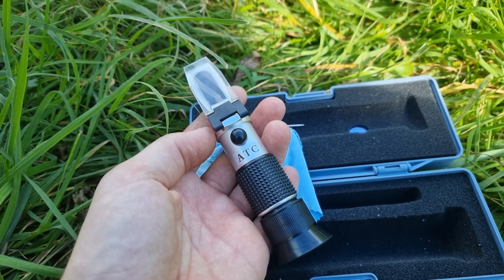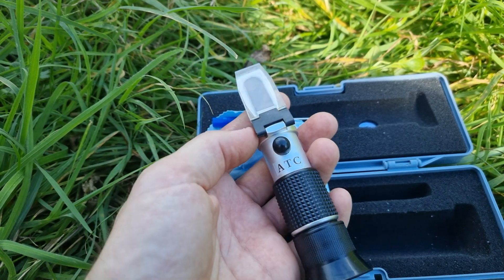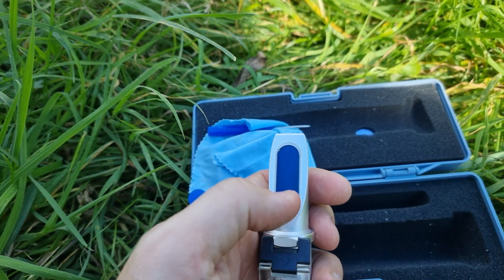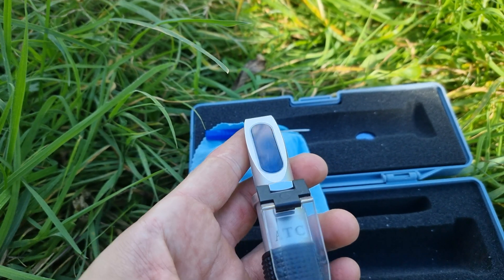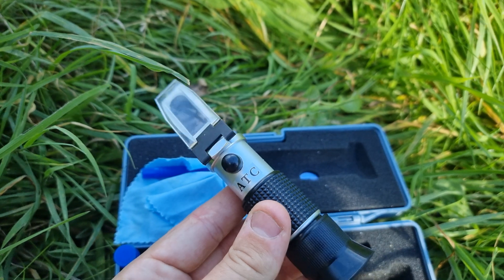A refractometer works by refracting light through the honey to give you a reading, and that reading gives you the moisture content. This piece up here — all you do is take it back, smear on a nice piece of honey covering the gauge all the way over, then flip it back down. Then you look into the eyepiece, holding it up to the light. You can see in the middle you've got your Brix — your sugar content rating — and then what you're looking for is that right-hand side column: that is the water percentage. For honey, we're looking for under 20%, and I like to target around 17% to 18%.